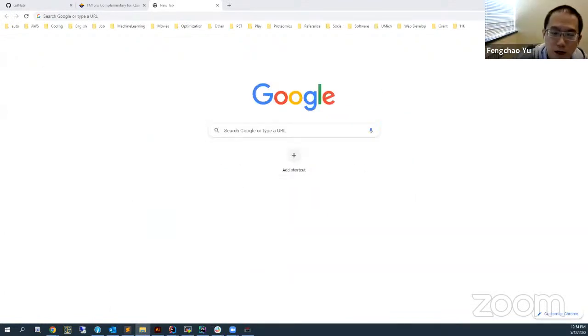So, okay. As Alex and Philip already presented, we have this FragPipe, and I will show you how to use it with little effort to set the parameters. Right now I have the latest released official FragPipe 17.1 on my computer. You just go to the folder and go to this bin folder. If you are on Windows, you can double click this one. If you are on Linux, you need to run this shell script.